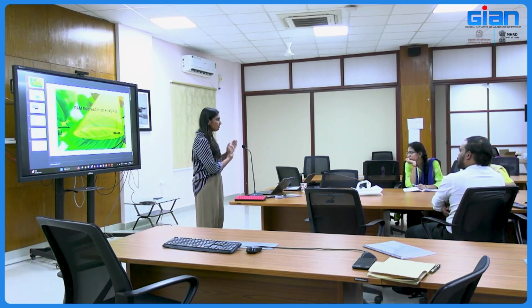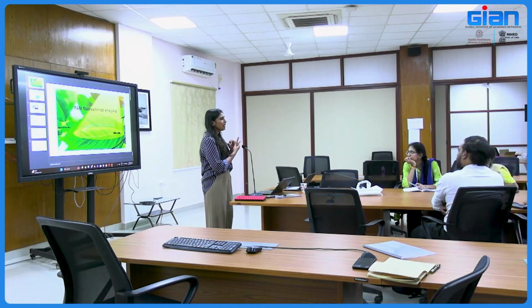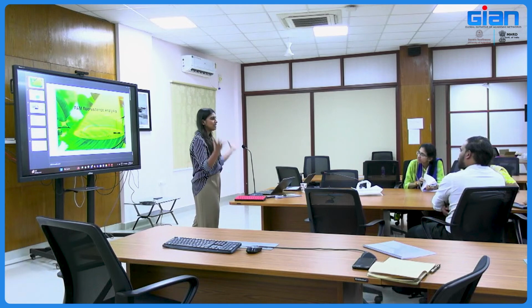This is the basics of all this kind of biophysical techniques we use, which differ only in whether we are using the fluorescent signal or the absorbance. That's it. So in PAM we use PS2 fluorescence to study, but for PS1 we use the absorbance. Why? Because for PS1 at room temperature, PS1 fluorescence is difficult to detect. It's negligible. In PS2, fluorescence is the largest.